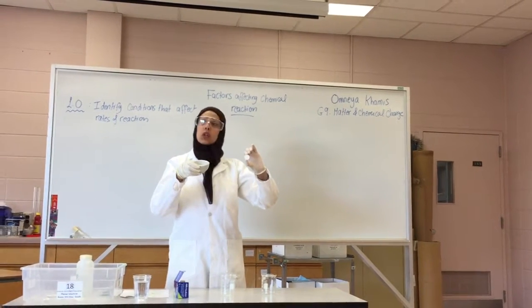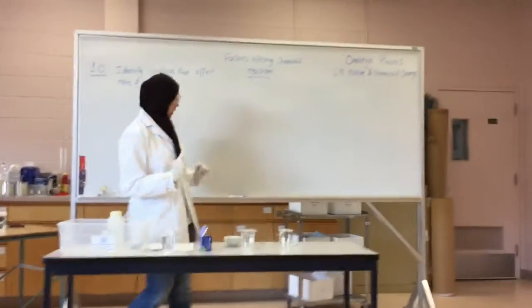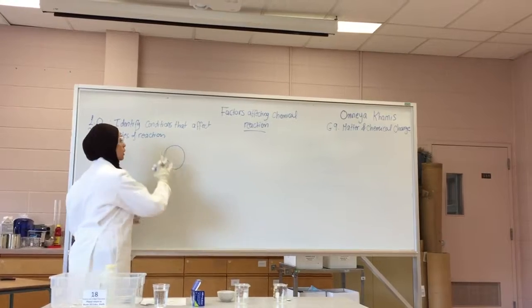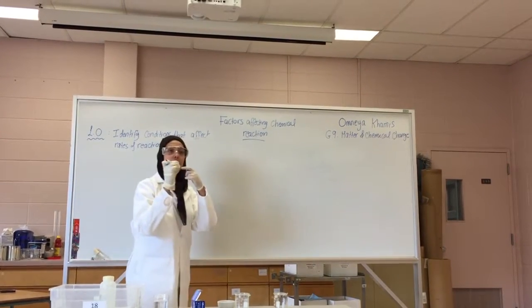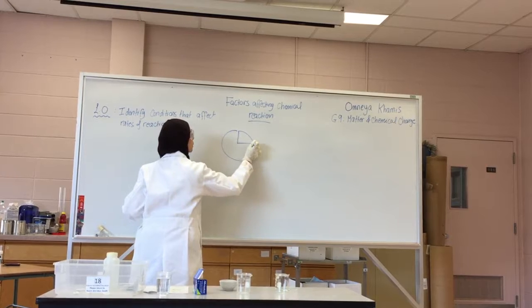The crushed. Why do you think so? Because it takes up more space. Yes, so if we can visualize what is happening, the surface area is the total surface of the tablet, right? So the upper surface, the lower surface, and the circumference, right? When I start breaking the tablet, what am I doing now?